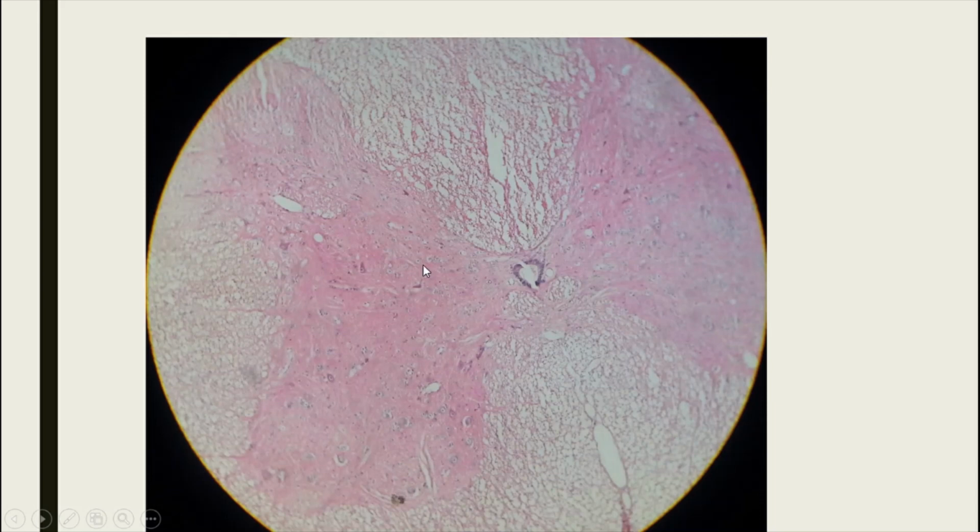All the other diagrams that we have studied are schematic representations. This is how it appears under the microscope. This is white column. This is gray matter with posterior and anterior horns. These cells represent the glial cells and the cell bodies of the neurons. The multipolar and bipolar neurons can be seen here. This is anterior and lateral horns. This is posterior horn.